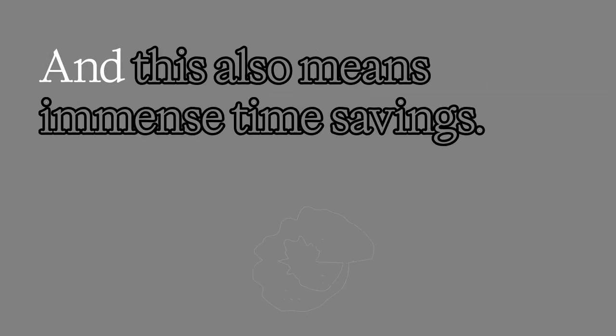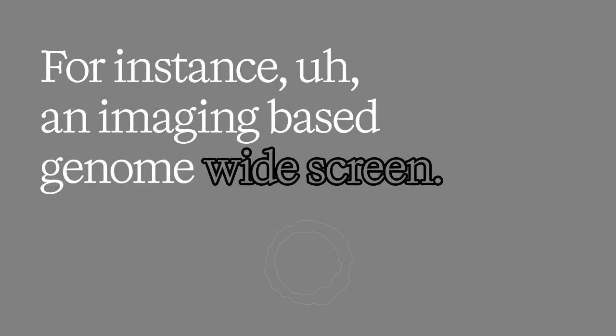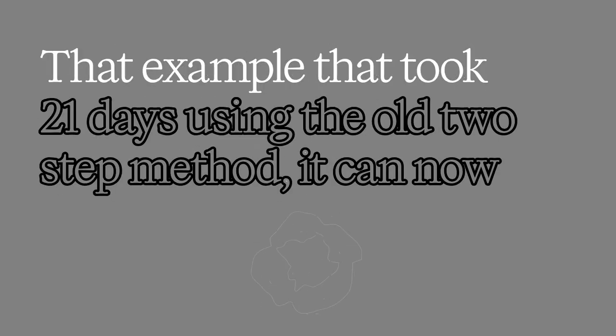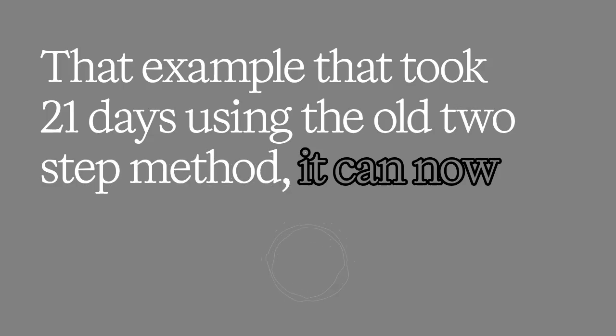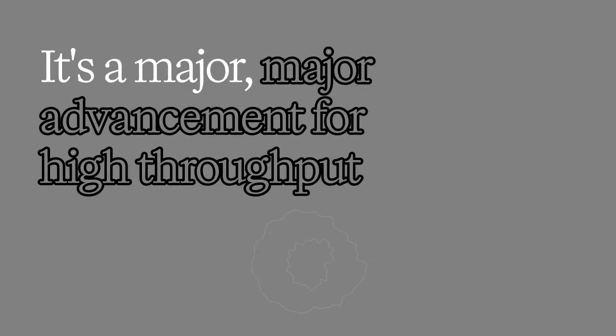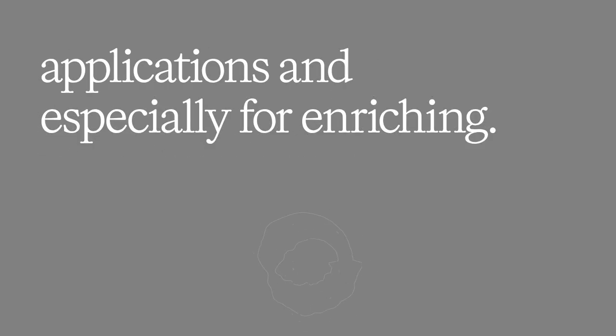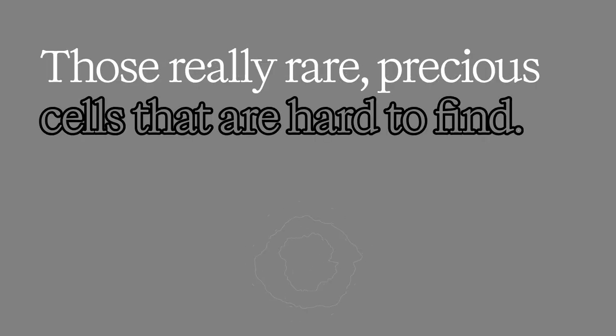It is. And this also means immense time savings. Yeah. For instance, an imaging-based genome-wide screen, that example that took 21 days using the old two-step method, can now be completed in fewer than 2 days with IACS. Wow, 21 days down to less than 2. Yeah. It's a major, major advancement for high-throughput applications, and especially for enriching those really rare, precious cells that are hard to find. That is a huge leap.